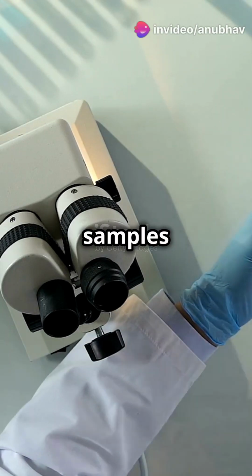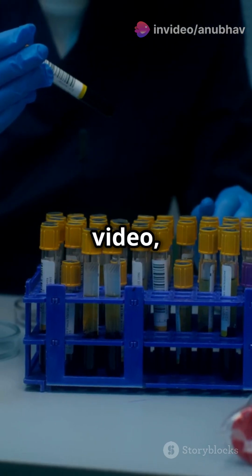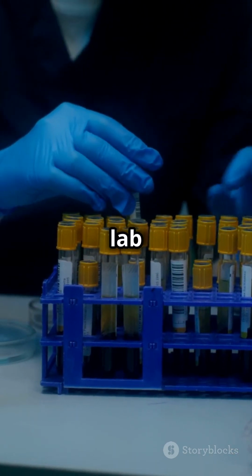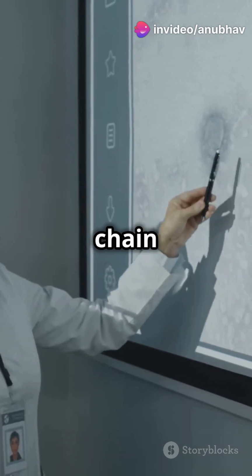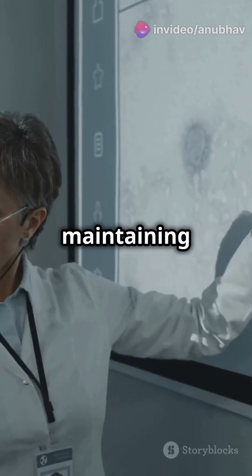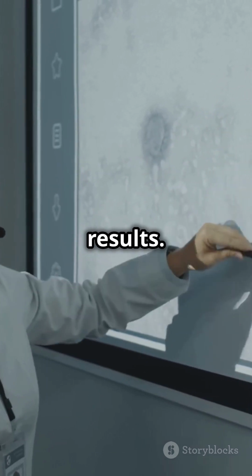Keeping your lab samples secure and traceable is easier than you think. In this video, we'll walk you through the essential steps to ensure that your lab maintains a robust chain of custody process. Let's dive into setting up a foolproof chain of custody process. This is crucial for maintaining the integrity of your samples and ensuring reliable results.